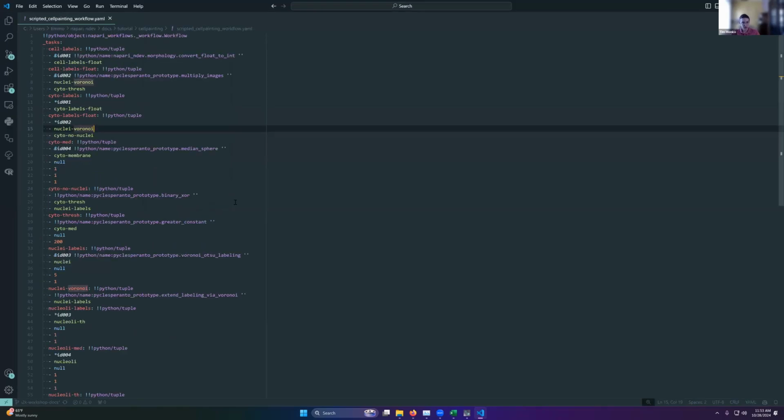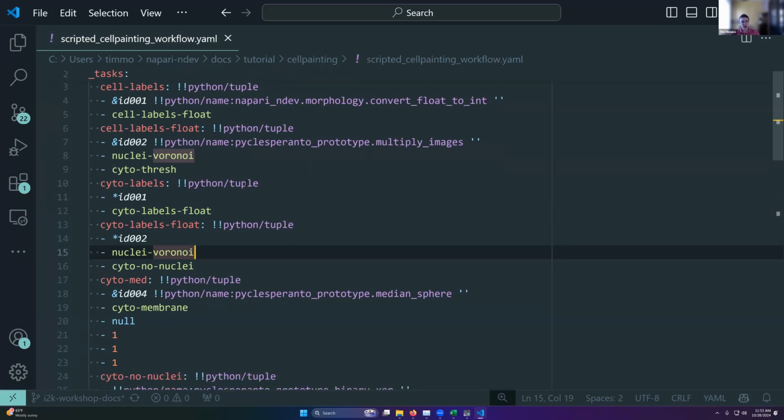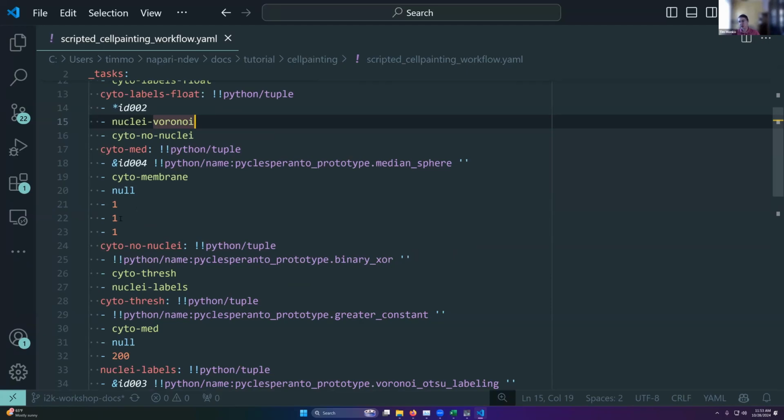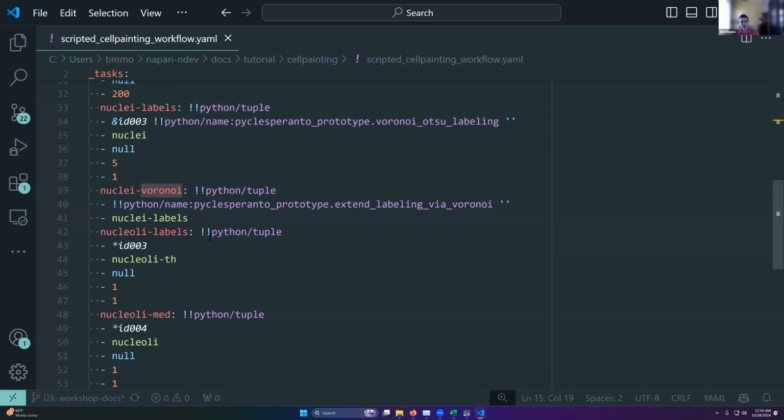Oh, control equal. There we go. It gives all the tasks and stuff. So you could, in theory, if you were comfortable, come in here and change the values. What I hope to do is make this possible in the widget in the future so that you can actually load in a YAML file and modify these values. But for someone who's experienced, you can update things from here, and that's really great.